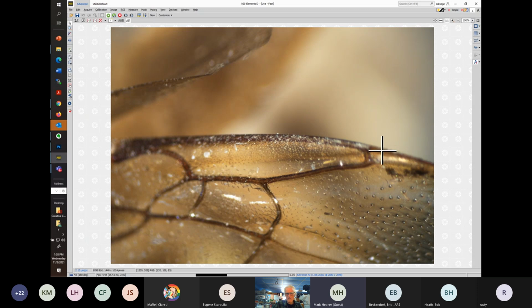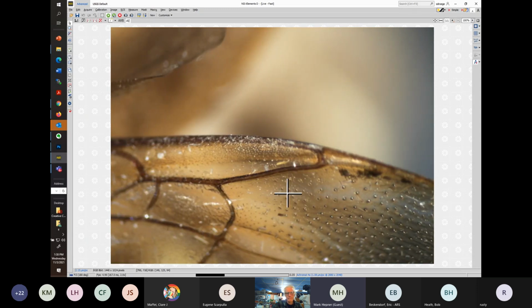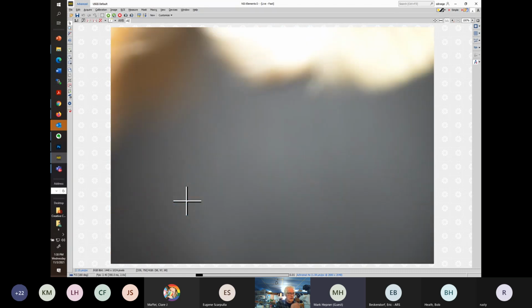And if that's the tip, then it's a distance away, but not liking that. I can see hairs in the cells there. So that's a start. Let's jump now to the guide. I'm sure we'll have to come back.